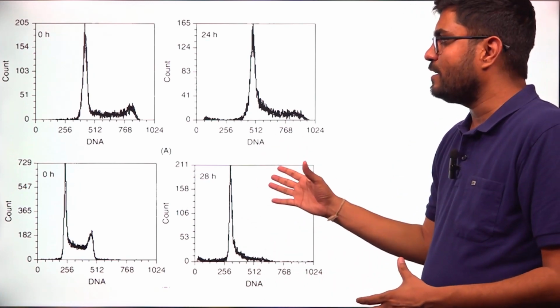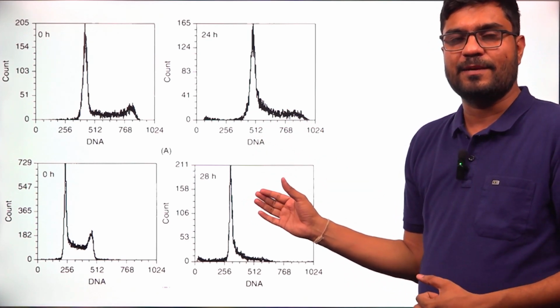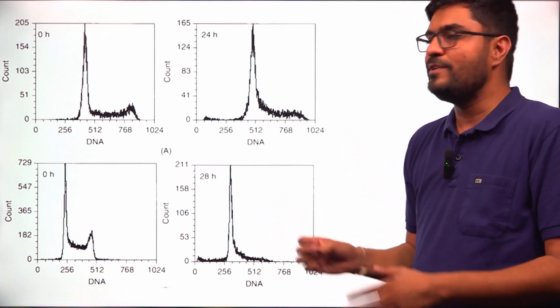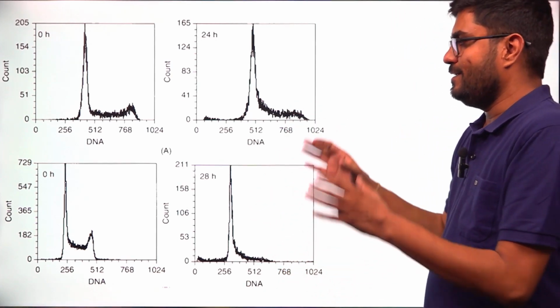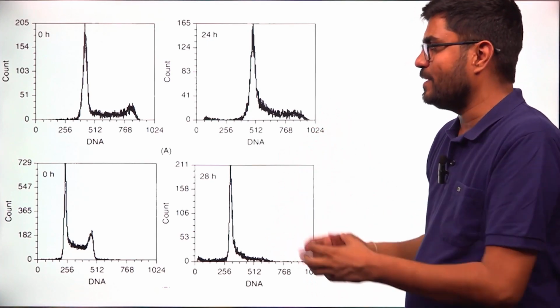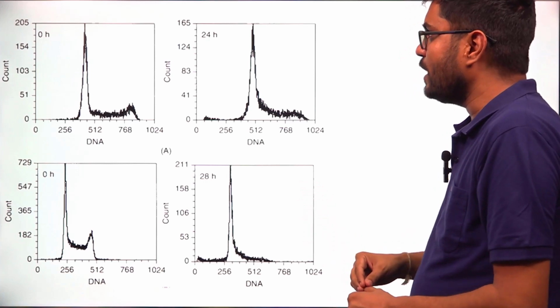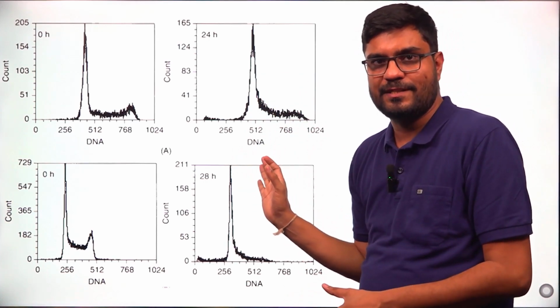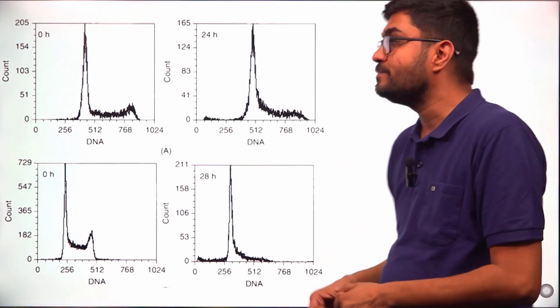We have understood how the graphs will look if the cell cycle inhibitors are blocking the phase G1 or the S or the G2. So we have understood both the concept, graph, some part of mathematical modeling and applications also. So before ending this video, I will be explaining the brief protocol, how we perform this assay, how we do the pipetting and what steps are important.